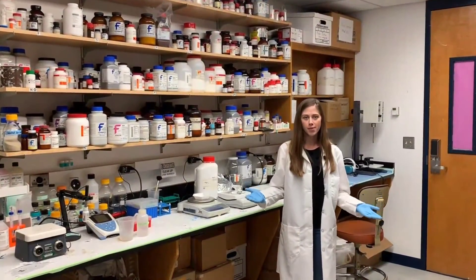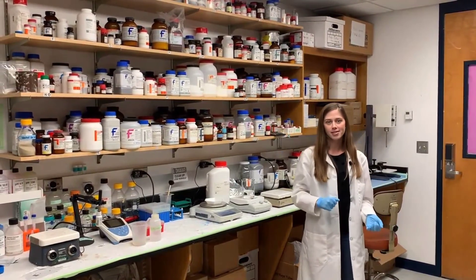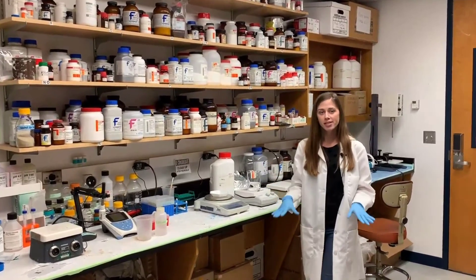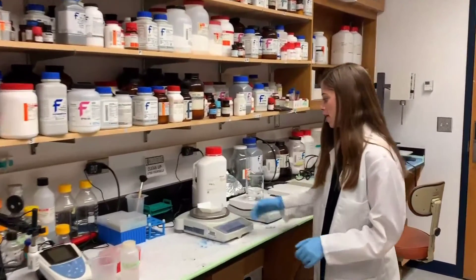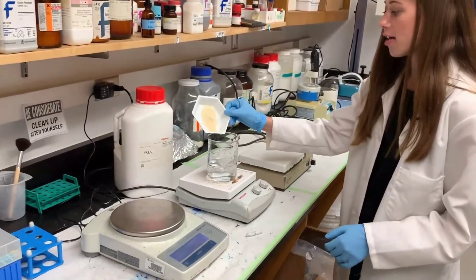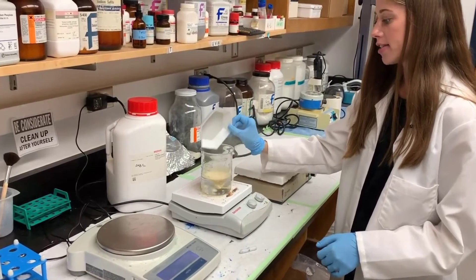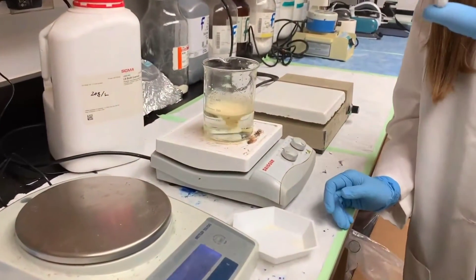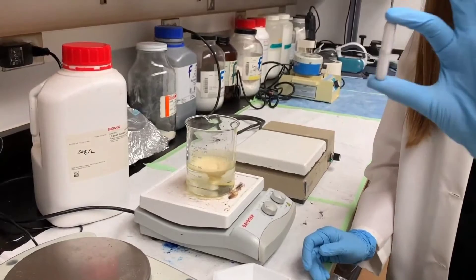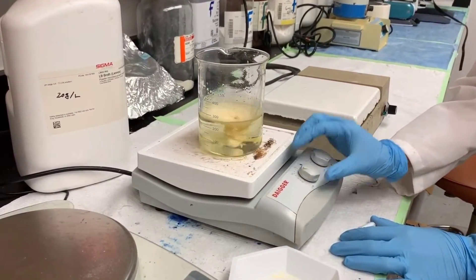Welcome to our chemical room, where we store all of the different chemicals needed for our different experiments. This is also where we mix all of our different reagents. We weigh certain things out on a scale, and then we use an automated stirring machine to mix different powders into liquids. It uses a little stir bar and a magnetized bottom — we can crank it up and get things stirring.